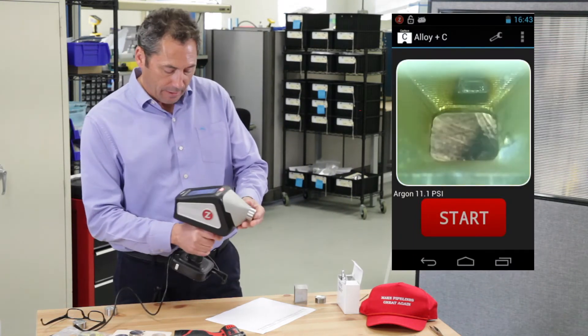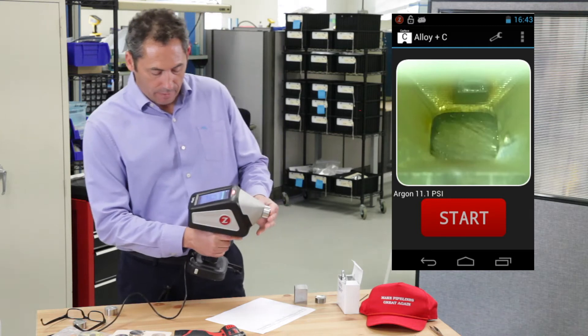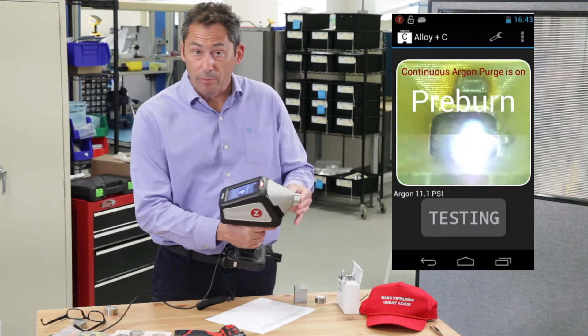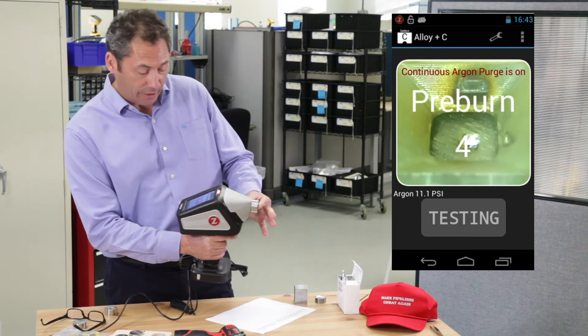Let's shoot it, get it on there, line it up. Okay, first thing happens, we do the pre-burn about six seconds while the argon is flushing as well.